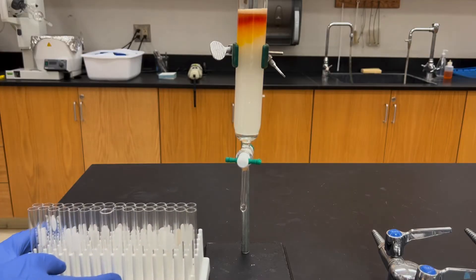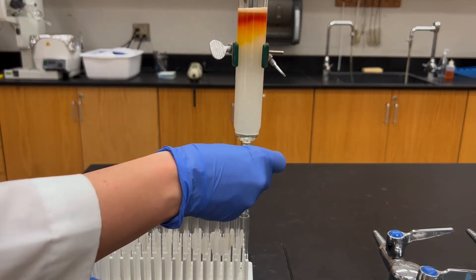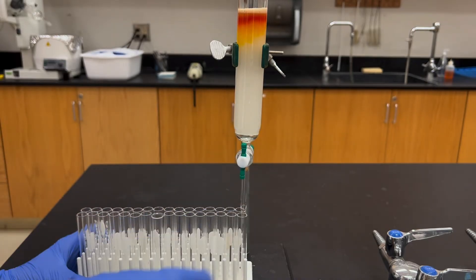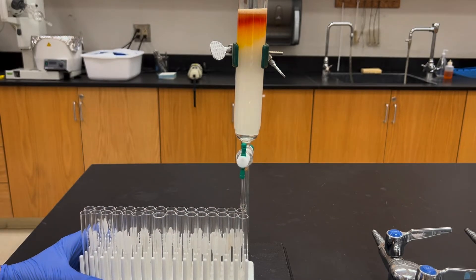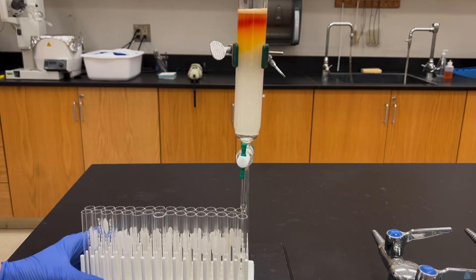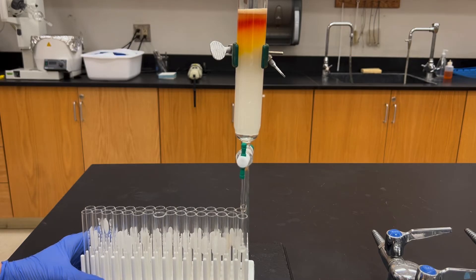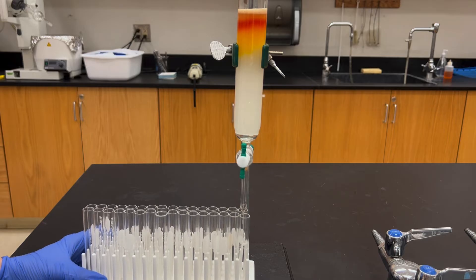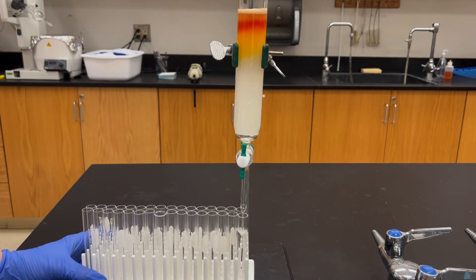After all that prep work it's finally time to elute the column. So open up the stopcock and let the liquid drain out into a test tube. When the test tube fills, move it over and collect the liquid into a different test tube. That's called collecting fractions and the goal is to collect different compounds in different test tubes, thereby separating them.